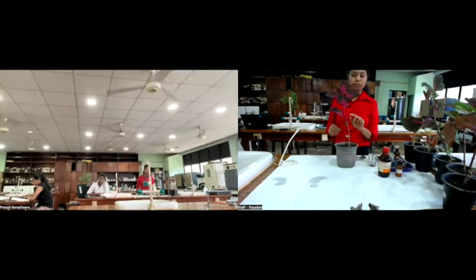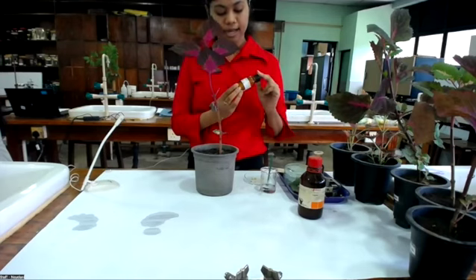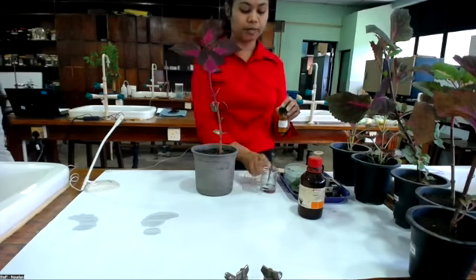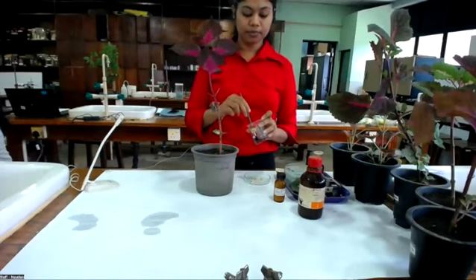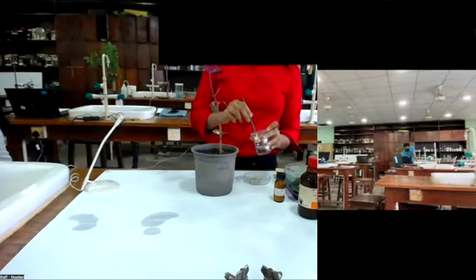To observe the effect of auxin on leaf abscission, we first have to remove the leaf coverage. Then we take 2 separate petioles. For one petiole we apply lanolin, and for the other petiole we apply auxin.